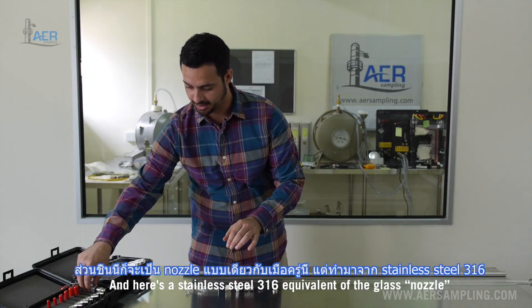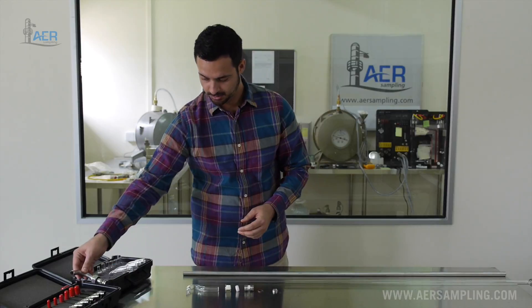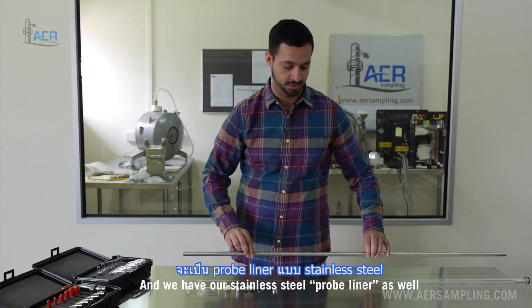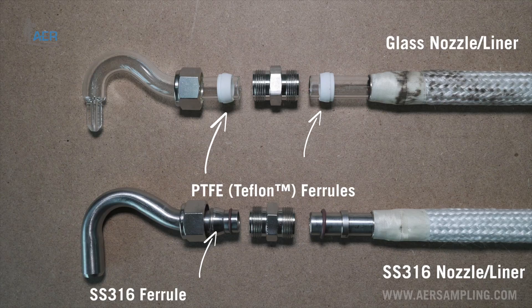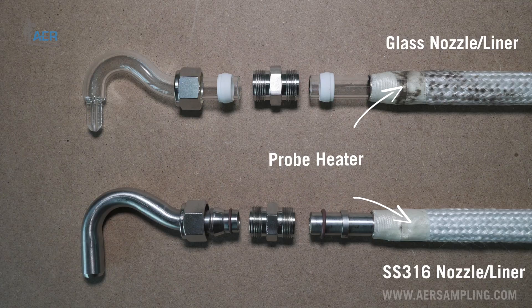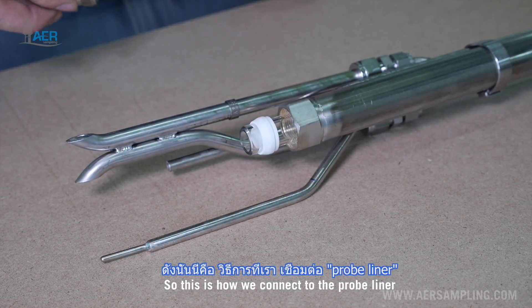Here is a stainless steel 316 equivalent of the glass nozzle. We have our glass probe liner here and our stainless steel probe liner as well. So we have our nut, our Teflon ferrule, our union, our o-ring, and the backer ring. This is how we'll connect to the probe liner.